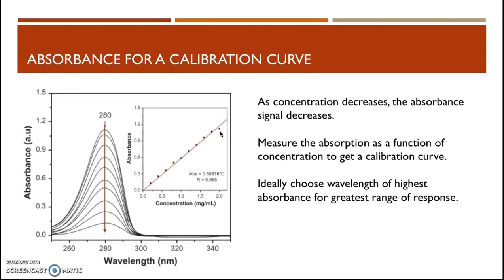You don't want an absorbance higher than that, because what that really means is that 90% of the light getting through your sample is being absorbed by your sample. And so if you increase your absorbance above about 1.5, the instruments can't read the light very accurately because there's not enough photons there to read. But you could choose a different wavelength to measure at if necessary.